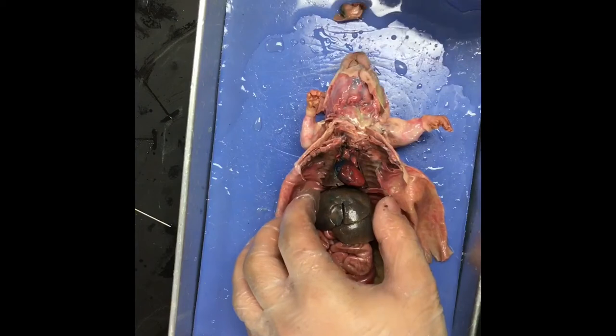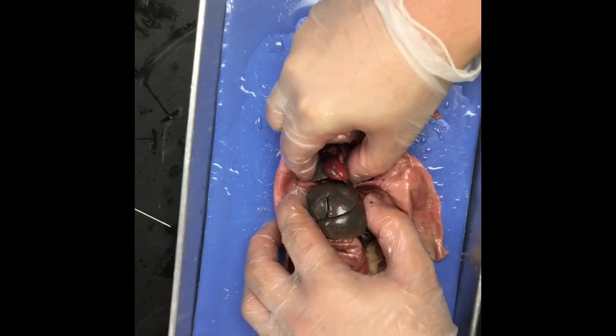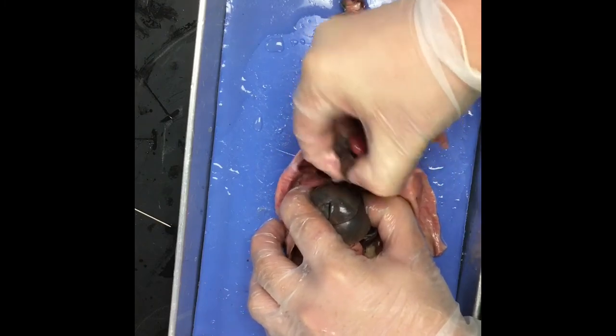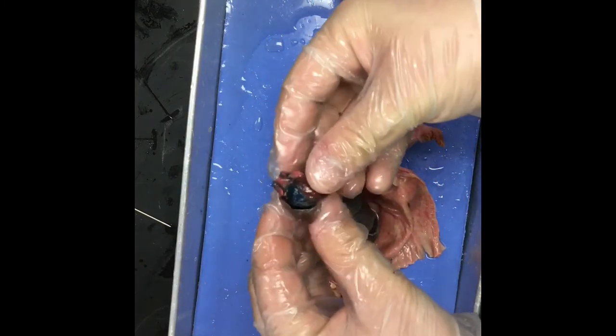I want a picture of the heart. Is that disgusting? No, you're going to get one in a minute. So, very delicately remove the heart and lungs. There you go. I remove the heart and lungs.